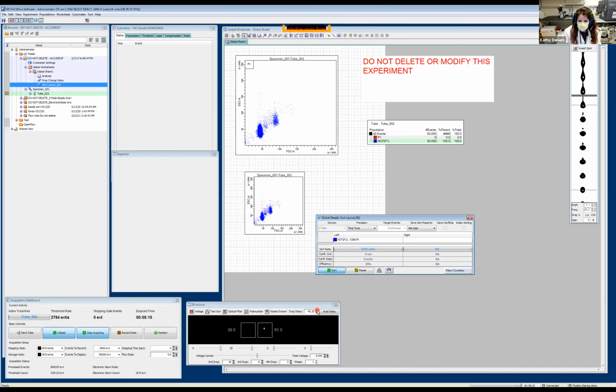Now, what I like to do at this point is go up one whole value. As I do, we see there's this number here that's a little bit high, 8.7, 9.7. So we're still seeing some Accudrop beads coming into the left in this window. So I try to go up a little bit higher in smaller increments, and as I do that, I see a lot less showing up in this optical filter to the left.